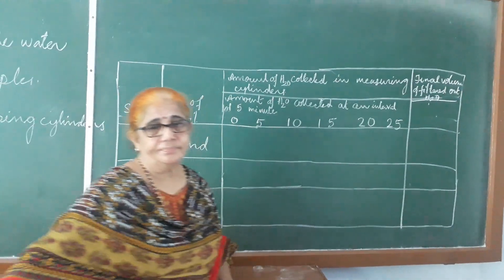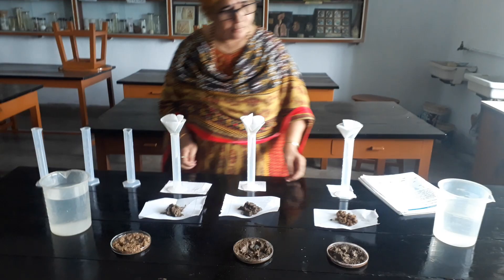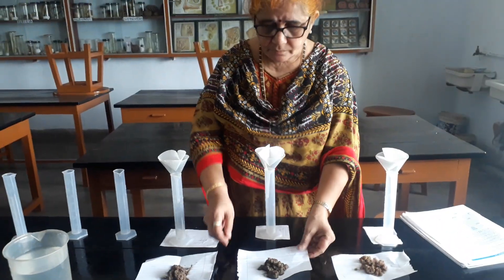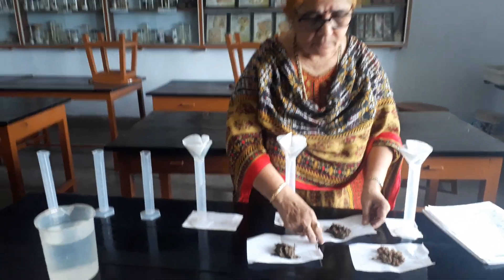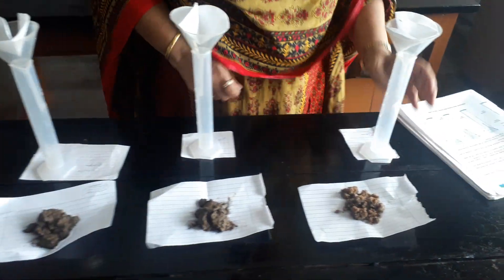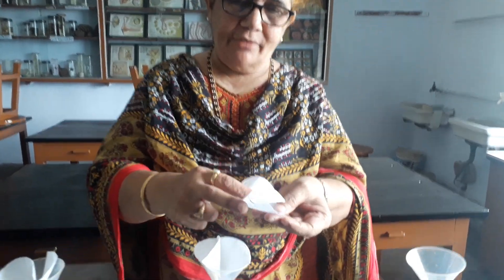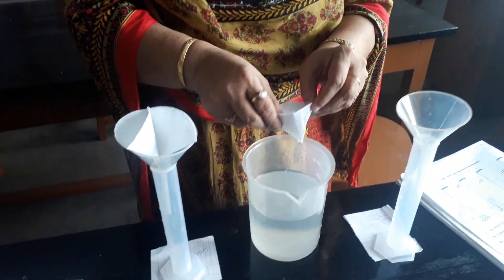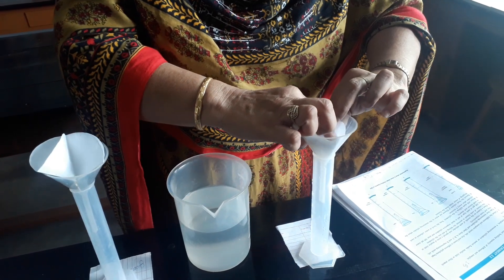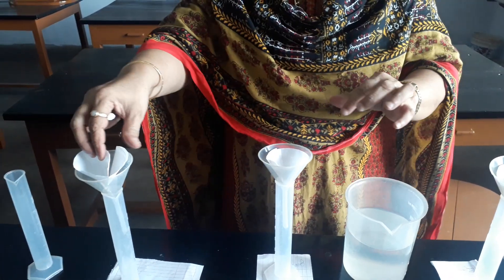In the procedure: measuring jars and measuring cylinders are taken. This soil is sand, this is clay, and this is silt. We take filter paper, fold it like this, make it wet, and keep it in the funnel so that the soil will not fall through. We make all three filter papers wet and place them.